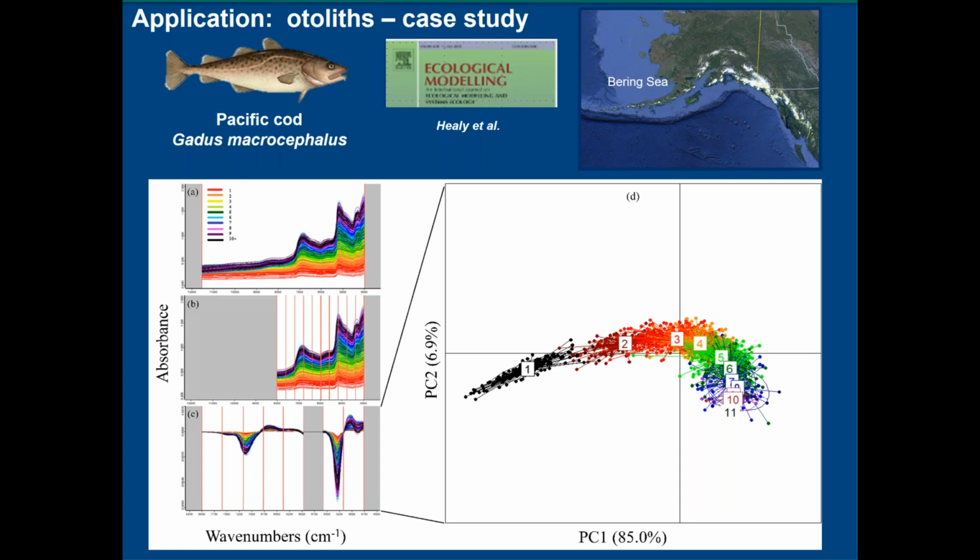Great, thank you. Next, we have two questions from Jeff Tingley, and I'll just read them both out. The first is, and you touched on this on one of your previous questions, but how is this approach likely to respond in a situation where traditional aging was systematically incorrect? For instance, where traditional aging shows a substantial under or overestimate for all the fish aged. And then secondly, once this approach is established, what would the typical cost per otolith to determine age be? Great questions.